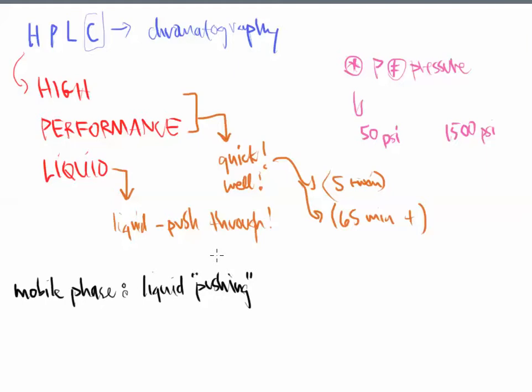So when I take a look at the mobile phase, there are three common mobile phases out there. One of these is the horrible, dangerous killer known as water.